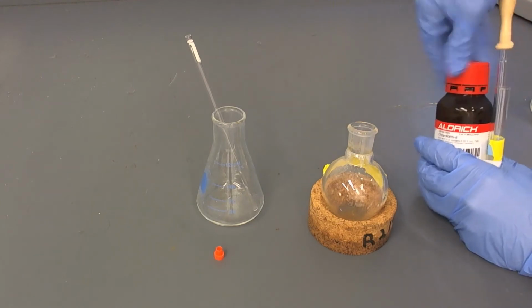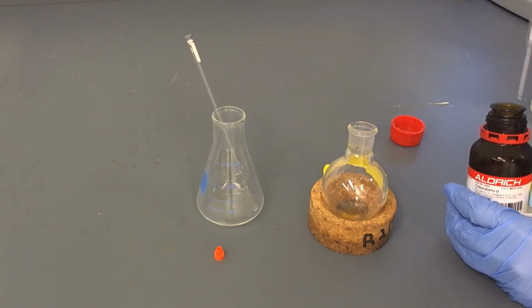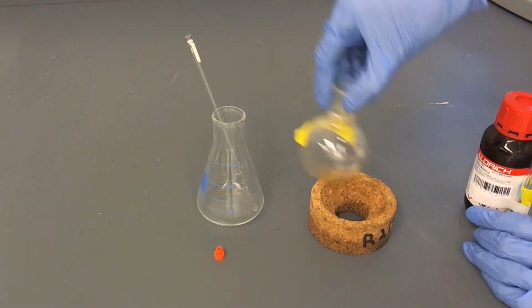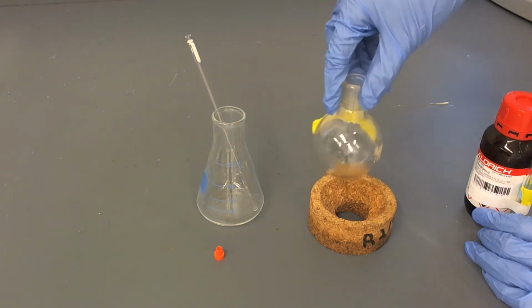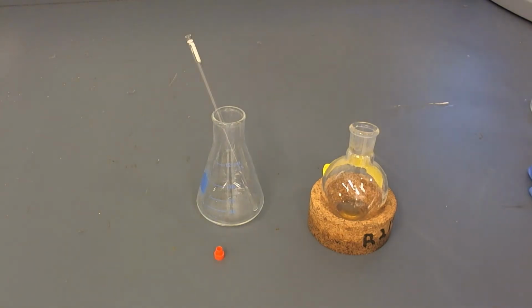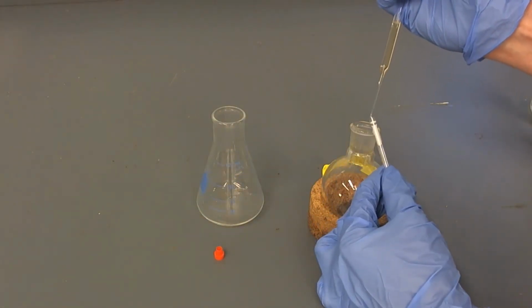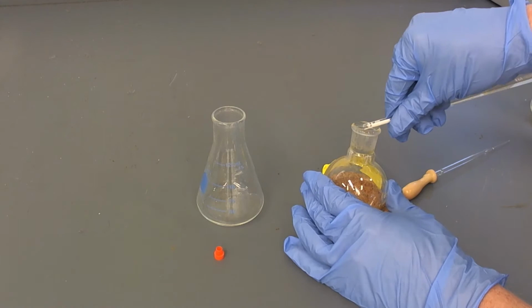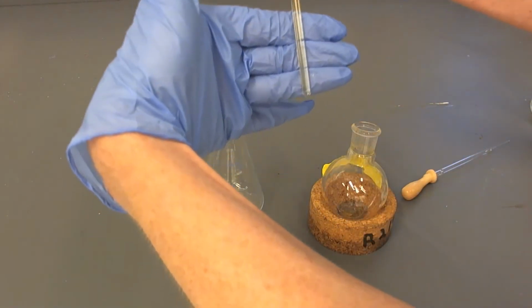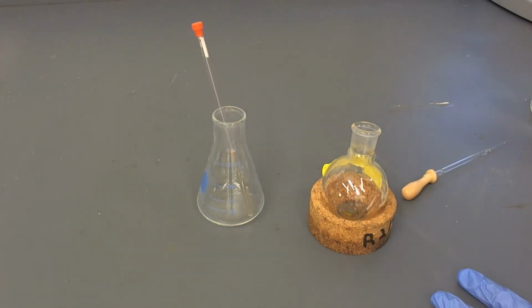Once again, I don't want to contaminate the stock pipette of solvent, so draw up about 1 pipette full. Just squirt that right in. Swirl until it's dissolved. Then grab a fresh pipette, draw up the sample and introduce it to the NMR tube. I've got a bit too much here, so I'm going to pour some of that out. I'm a little over 3 fingers height, but that is certainly fine for our instrument. Rough and tough, 3 fingers height is good. So that's another way to make a sample from a liquid.